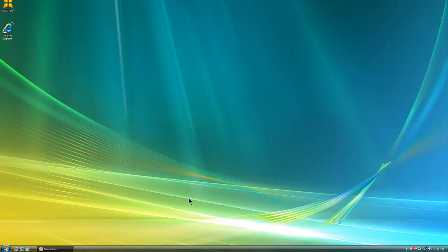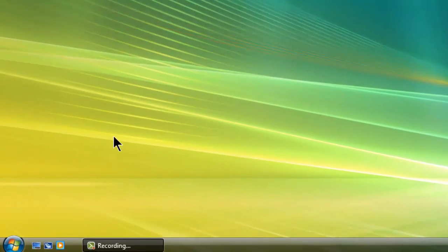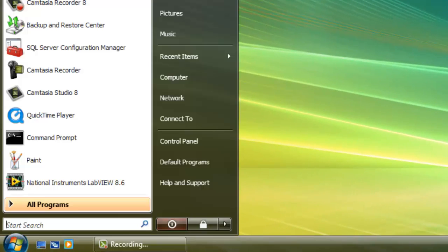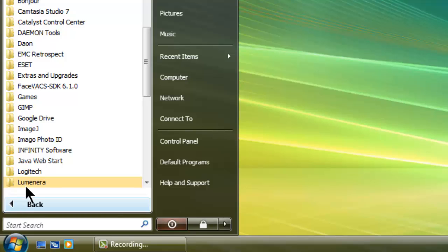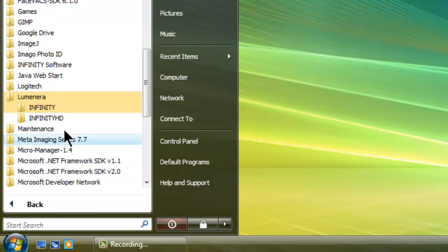And there you have it. Your camera is now ready to use. You can find the camera software in the start menu under all programs, Luminera, Infinity.